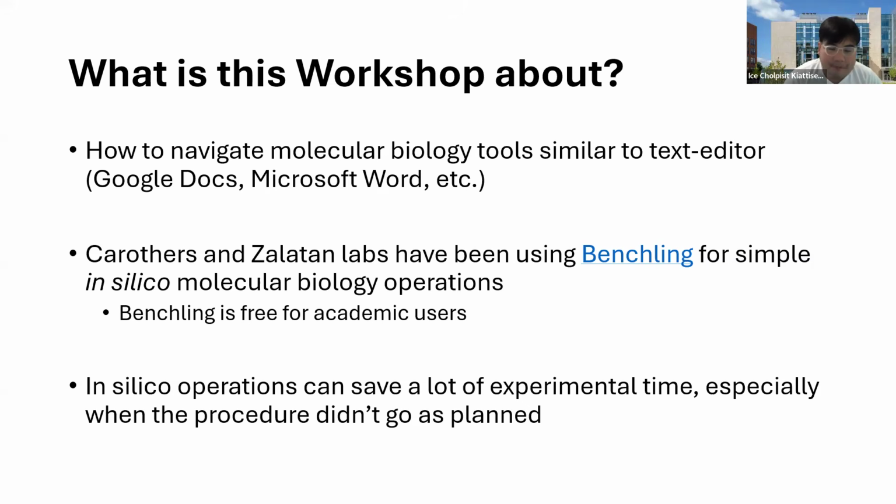But in molecular biology it's a little different, because most of the information stored is not in the Roman alphabet, A to Z, but rather A, T, G, C. They are also double-stranded, so the tools used for this exploration are a little different.